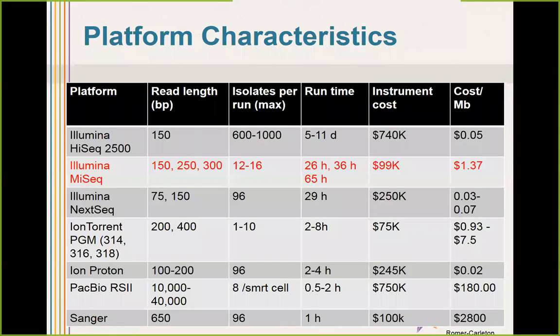Epidemiologists should understand which platform their lab is using as next-gen sequencing is adopted more readily. They should do this in order to understand the limitations of what their laboratory can provide. I think a lot of times epidemiologists ask their lab to get testing done for investigations, sometimes without really understanding the turnaround time or the quality of what they might be getting. So it's important that open communication between the two can be extremely helpful in setting up a program in your department. It can set expectations on how often specimens may be run, guide follow-up questions for an investigation, and develop a workflow.